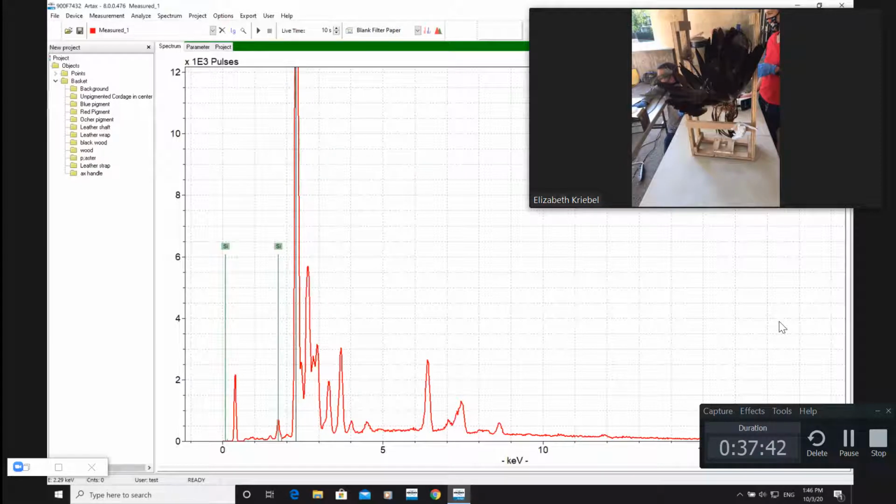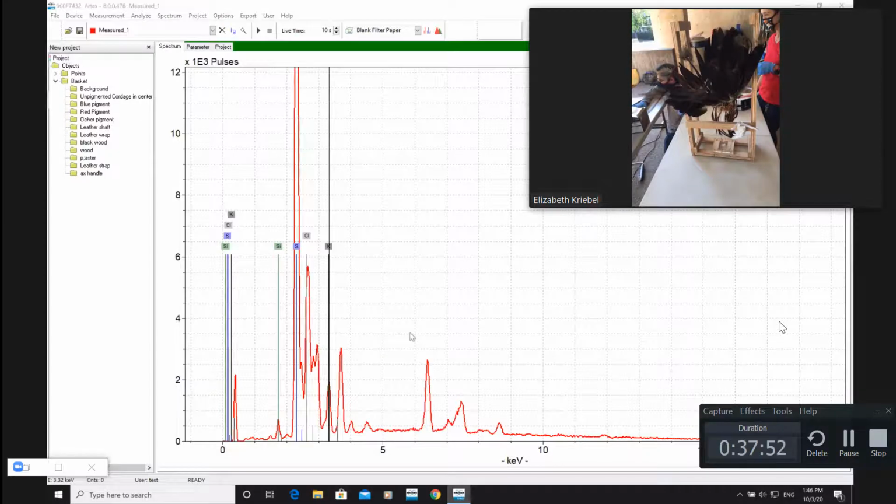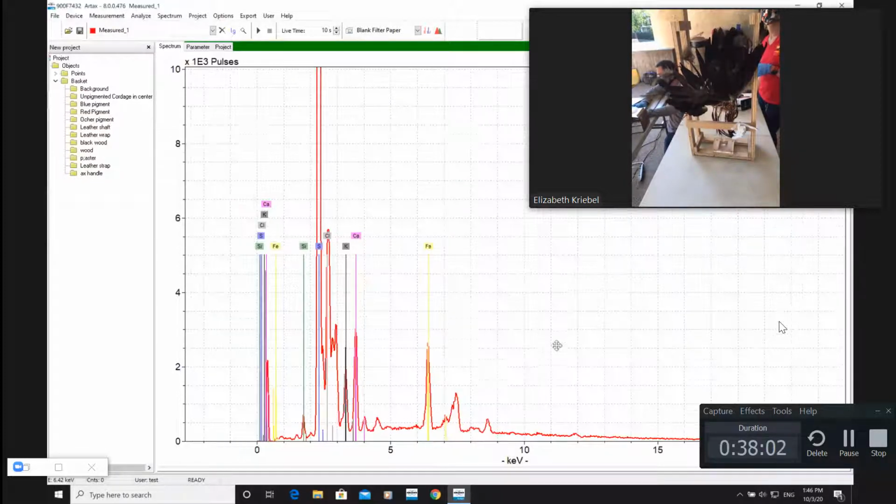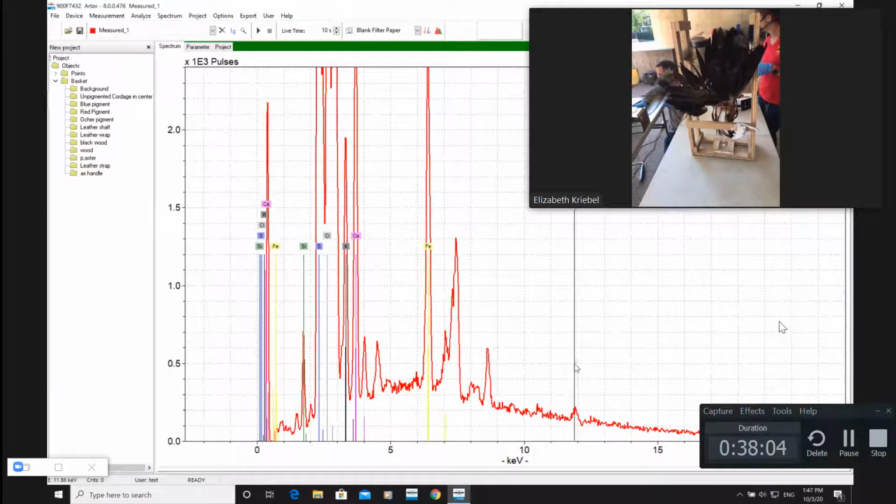Got it. Thank you. All right, so what we have here, opening up our periodic table, we're looking at silicon, a ton of sulfur, a ton of it, a little bit of chlorine, potassium and calcium, some iron, and I've got good news for you. There's some bromine, and there might be a trace of lead, but this is not a ton of lead, or mercury or anything. These feathers are not toxic.